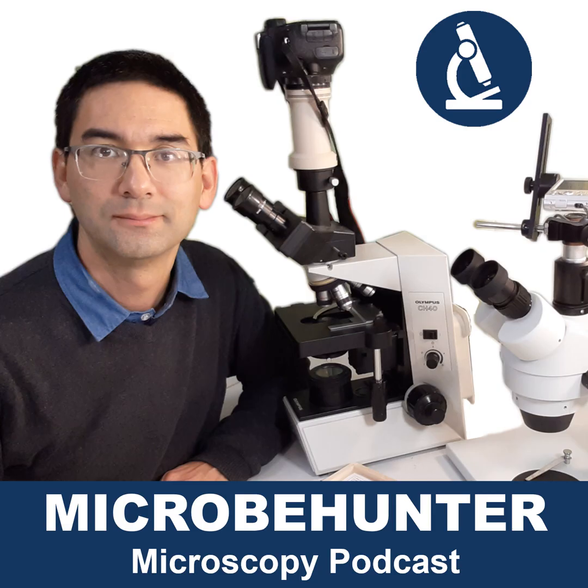Now, yes, there are certain research projects where microscopes do play a very important role. I'm not questioning this. And in this case, often you use fluorescence microscopes where you're labeling certain proteins in a cell with a fluorescent antibody, and then you're using UV light from the microscope to make those molecules light up. Very specific techniques, okay? So yes, microscopes are used in research, of course, a lot, but often the applications are very, very specific.